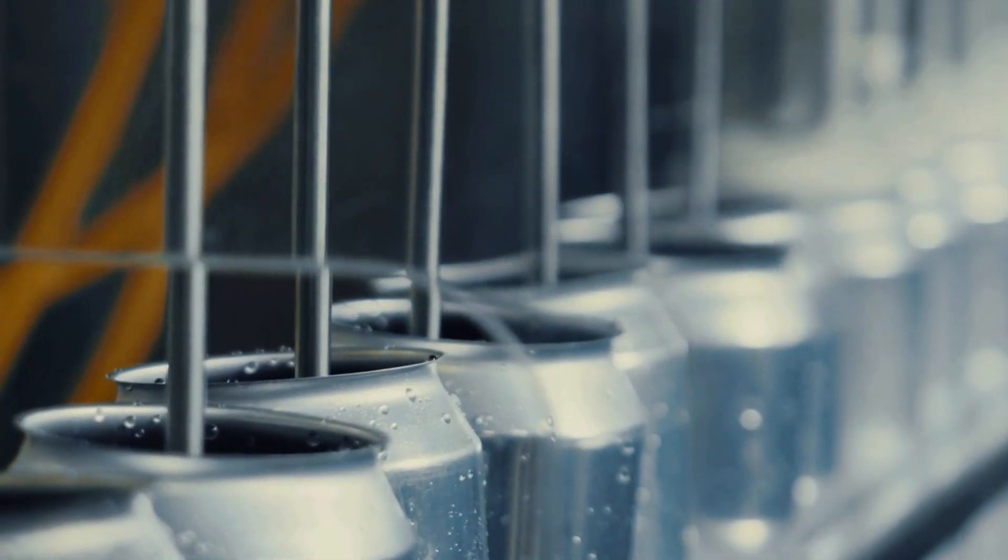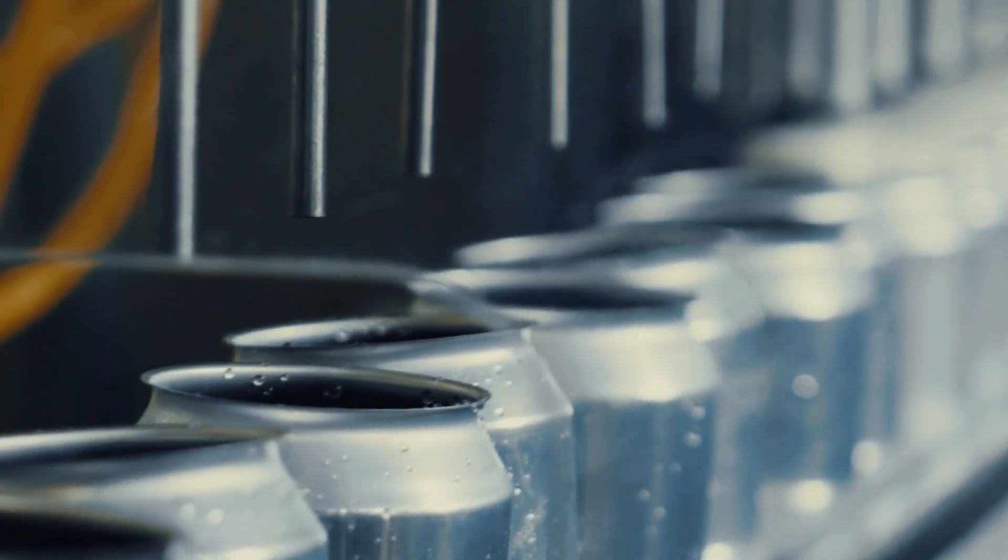This can be used on a bottling line to determine what soda you're actually bottling. It also can be used in their base product where they're actually making the syrup for it to blend together. And then also when they're blending the syrup with the carbonated water to ensure that it's staying at the correct consistency so it tastes the same from bottle to bottle.